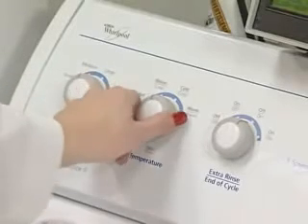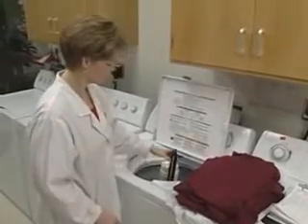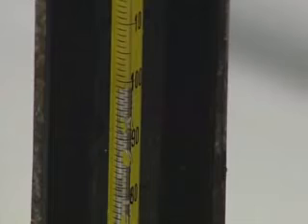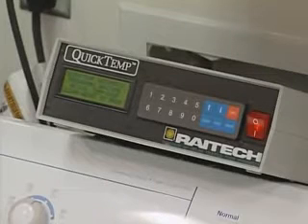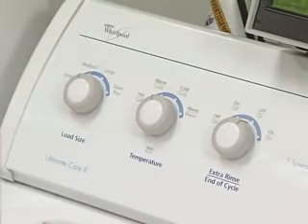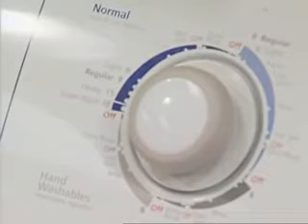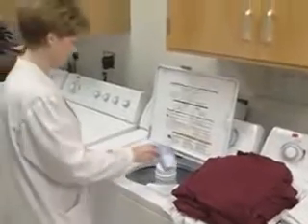Set the water temperature control to the appropriate setting for the wash and rinse temperatures. Check the wash temperature with a dip thermometer. Temperature control systems are available that are very effective in controlling the washing and rinsing temperatures. Fill the washer to the water level setting required to achieve an 18-gallon level. Set the washer for a 12-minute normal cycle. Add the required amount of standard detergent.